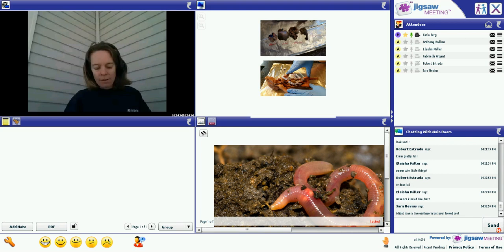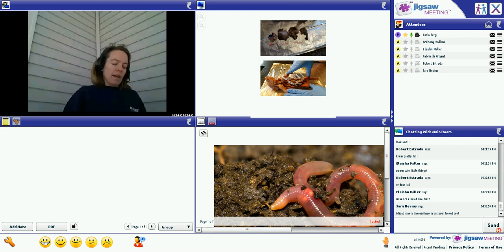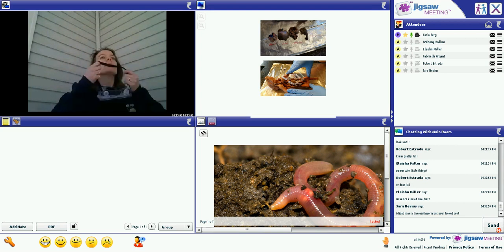Okay, so now we are going to go ahead and get out our earthworms. All right, so a few things before we get started. Everyone needs to have their safety glasses on. If you don't have safety glasses on, go get a pair of sunglasses, something to cover your eyes.